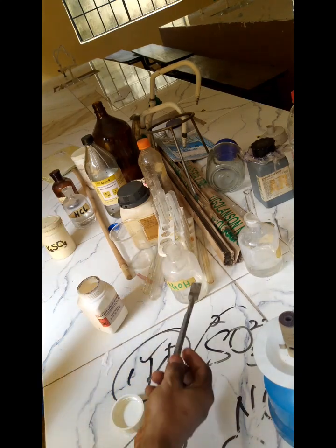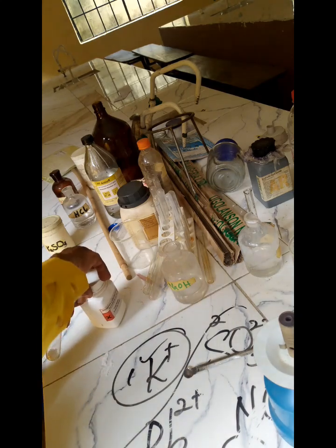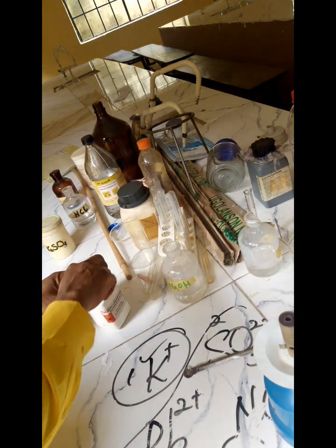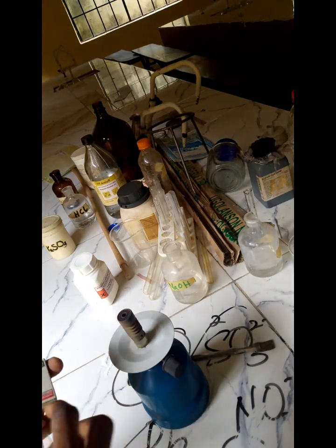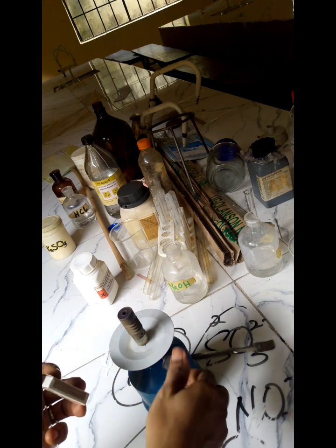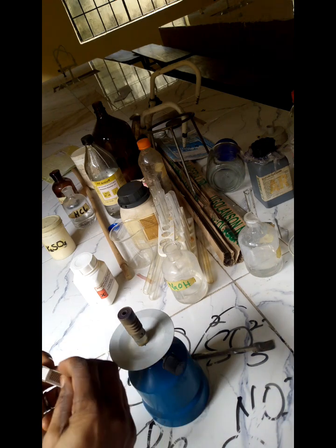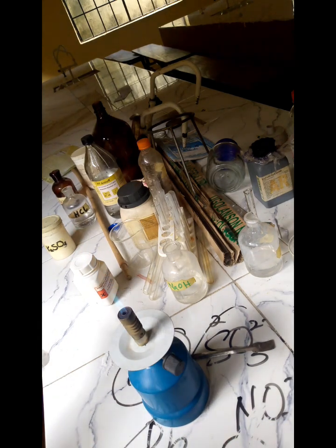I have some lead nitrate here in the boiling tube. Let us heat it and see what the outcome will be. As usual, this is my Bunsen burner, and that's the flame.